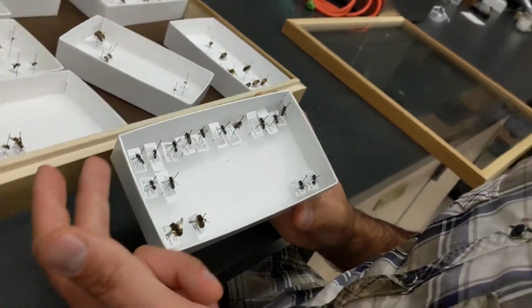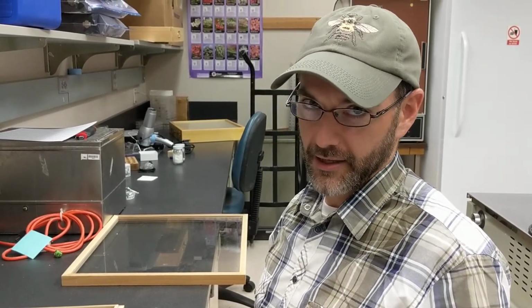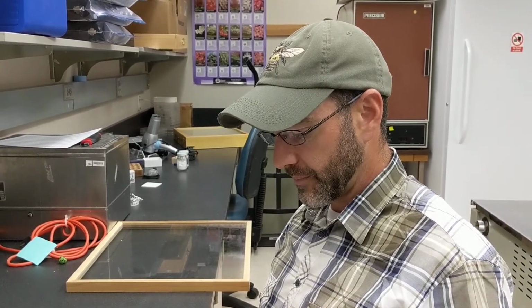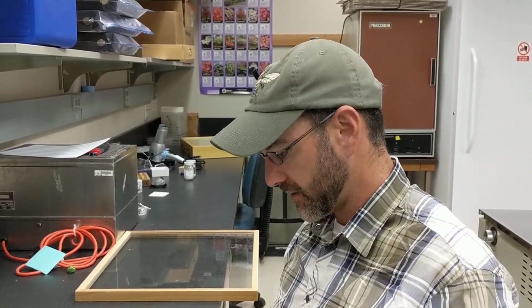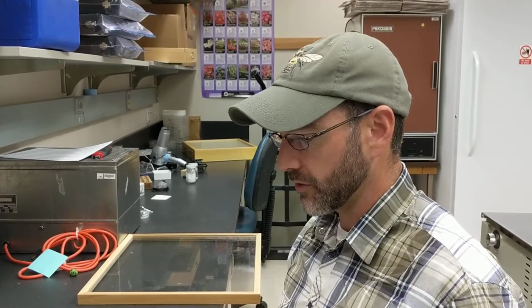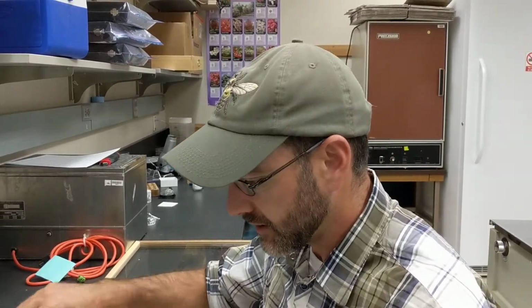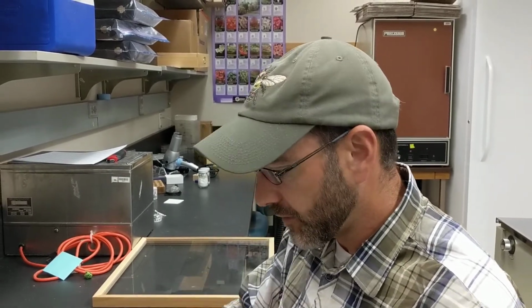You got it. And so you can see just with your eye, and hopefully on the video, the Megachile are black bees with pale hairs. The Anthidiines are bees with maculated colors on their integument, and then obviously most of the Osmia are going to be metallic blue, green, or dark kind of indigo. And so you're able to, by eye, recognize those, and there's not a lot that's left over at this point.